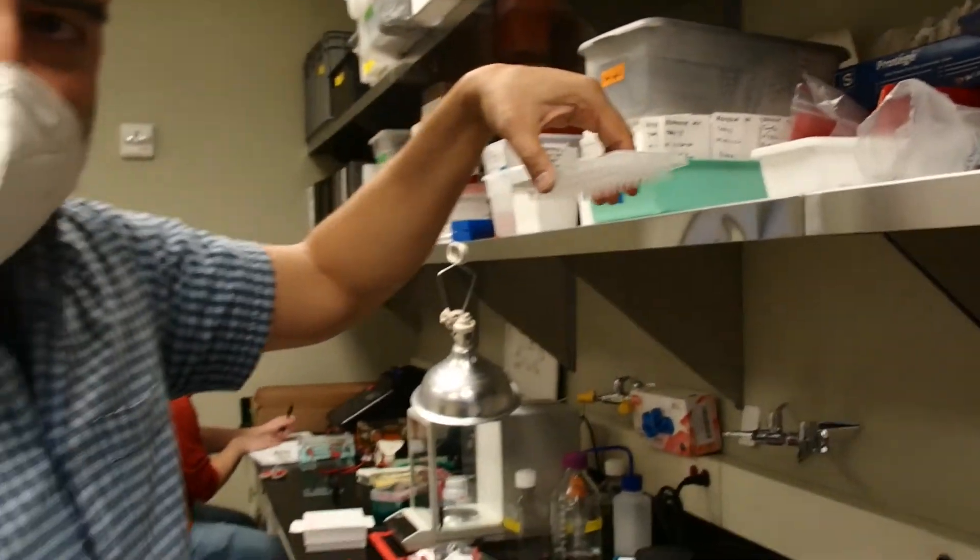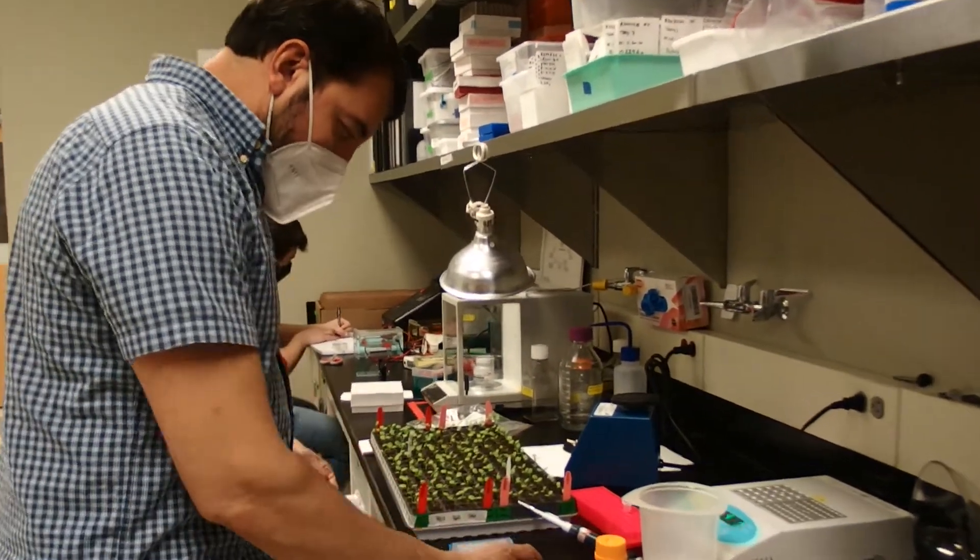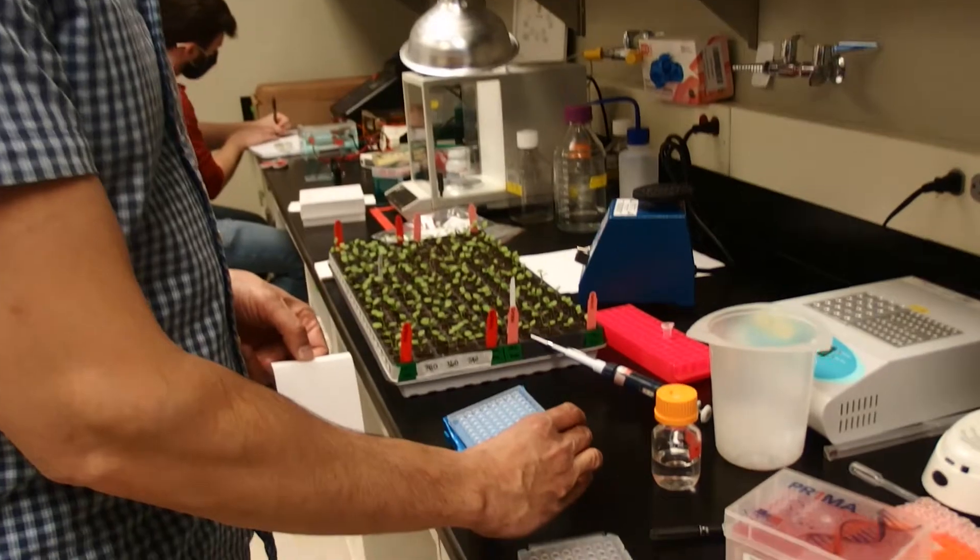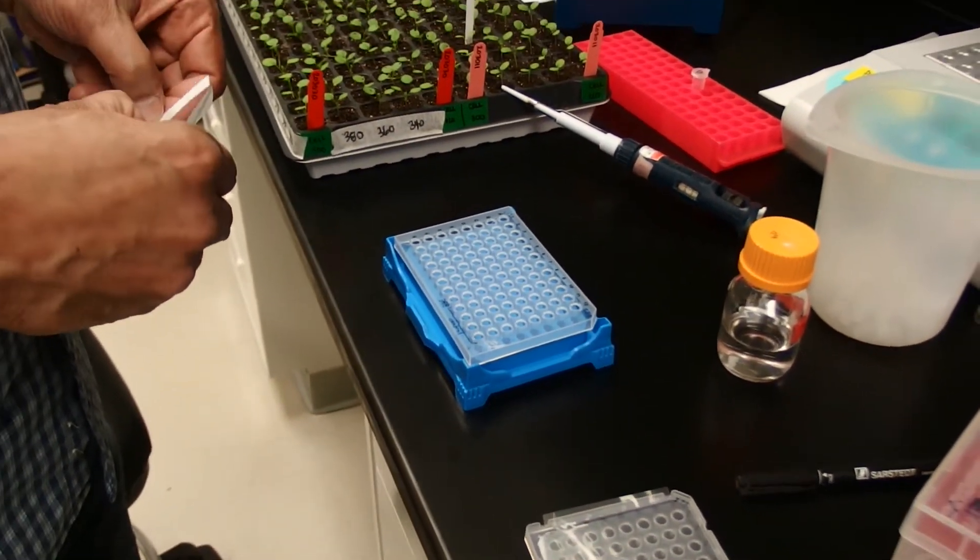Then we have our templates and we don't want to throw that away because what if we got to do this again or something like that. So we'll go ahead and save it.